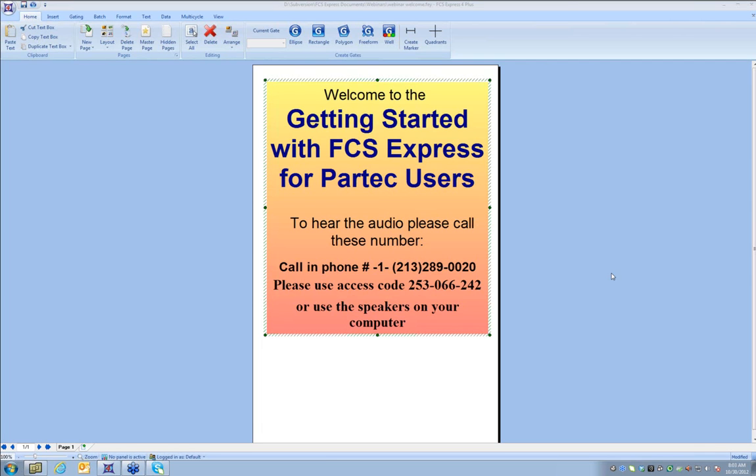So we'll start with an introduction from Dr. Danny Kohler at Partec in Germany. Right now, he'll give a little introduction to the Partec software and to the Partec in general, showing how to do many things. And then the last part of the webinar, we will show a little bit about how to use FCS Express to give you guys a bit of a head start. So let me turn the control over here to Danny.